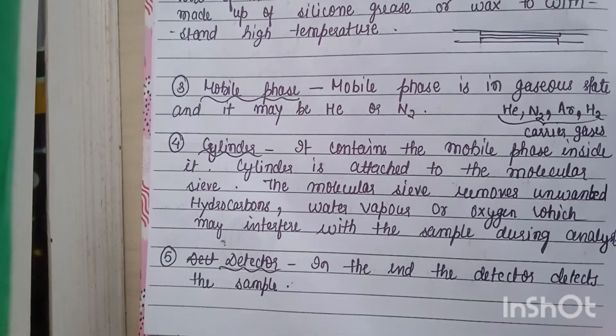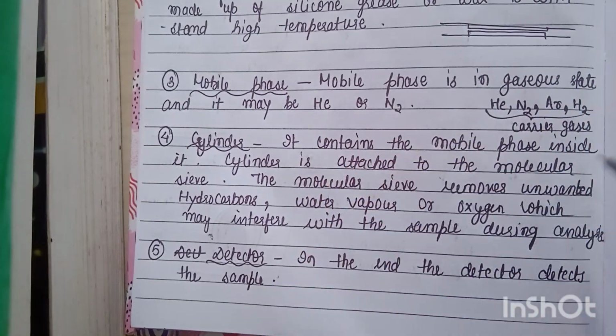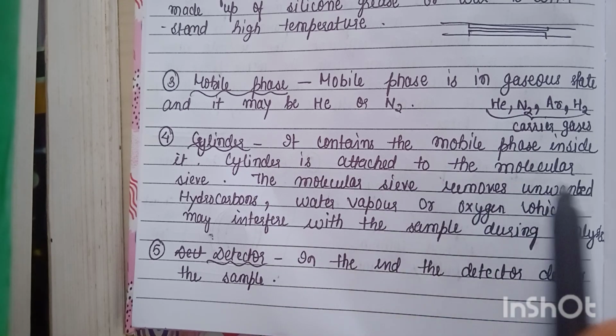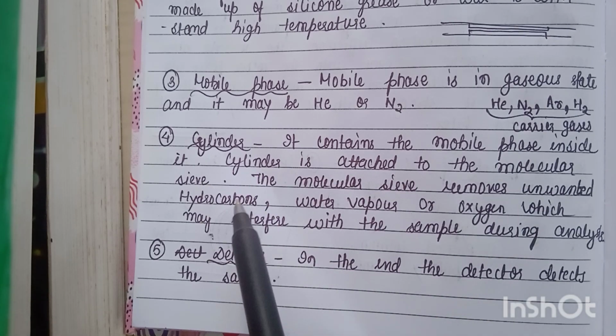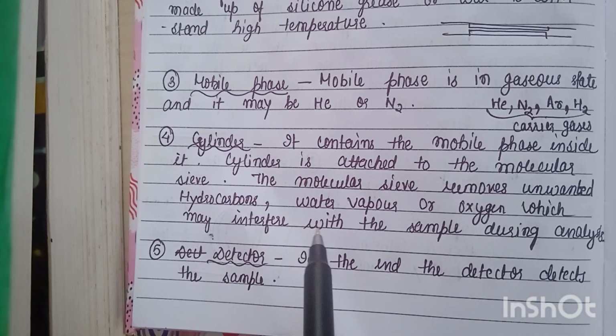The fourth component is the cylinder. The cylinder contains the mobile phase inside it. Cylinder is attached to the molecular sieve. The molecular sieve removes unwanted hydrocarbons, water vapor or oxygen which may interfere with the sample during analysis.